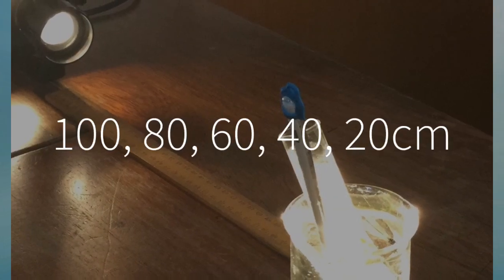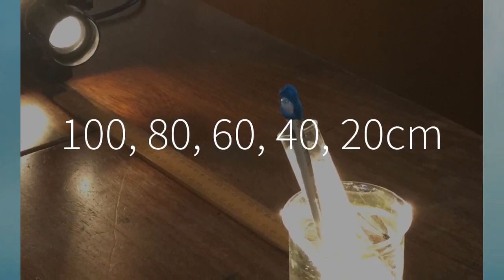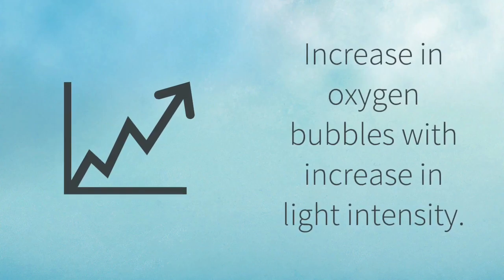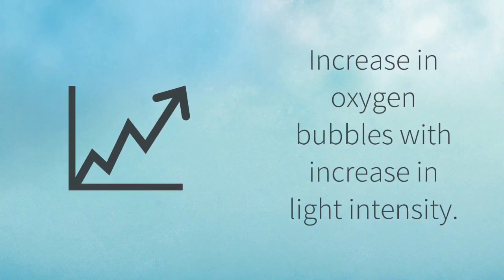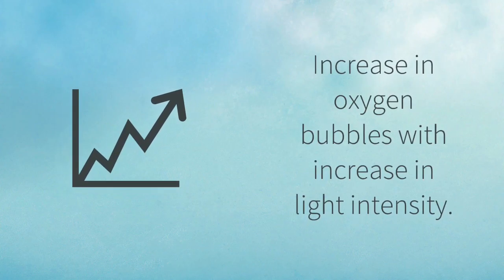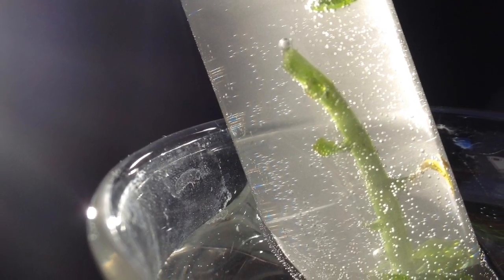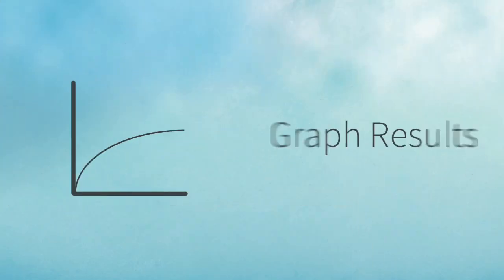To vary light intensity, we varied the distance the allodea was from the lamp. The results showed that the closer you got to the lamp, the greater the increase in the release of oxygen bubbles. With increasing light intensity, there was an increase in the rate of photosynthesis, and when the practical was completed, we graphed our results.